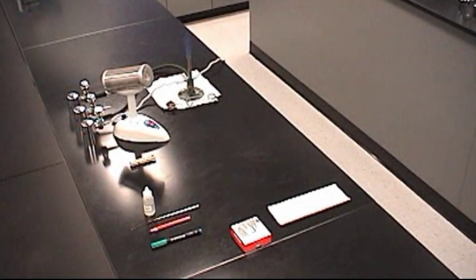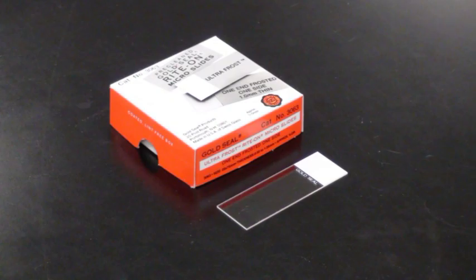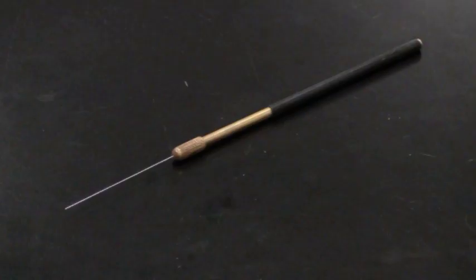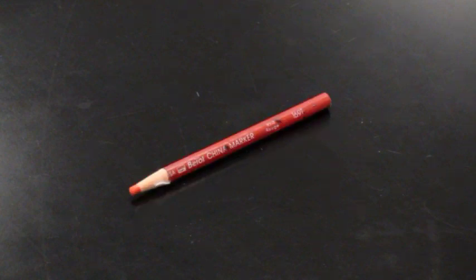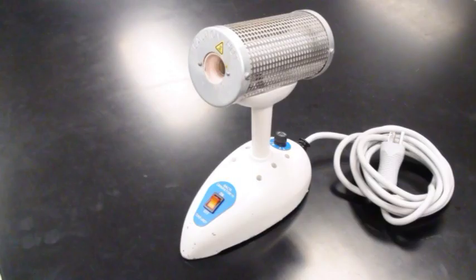To prepare a smear from a solid medium you need a plated culture, glass slide, inoculating needle, permanent marker, china marker, water dropper, and bacterial incinerator.